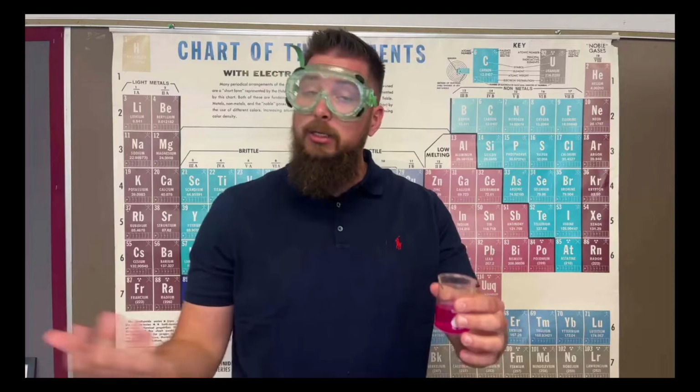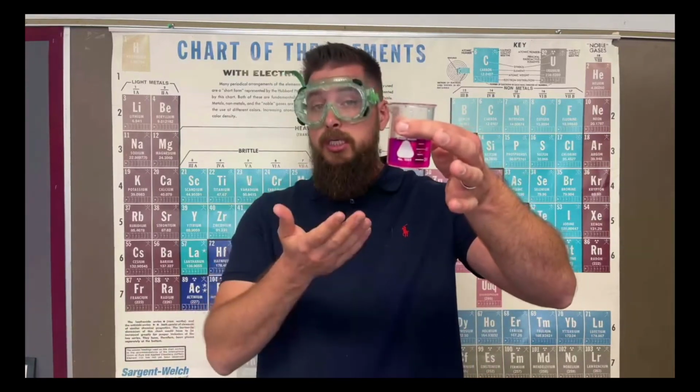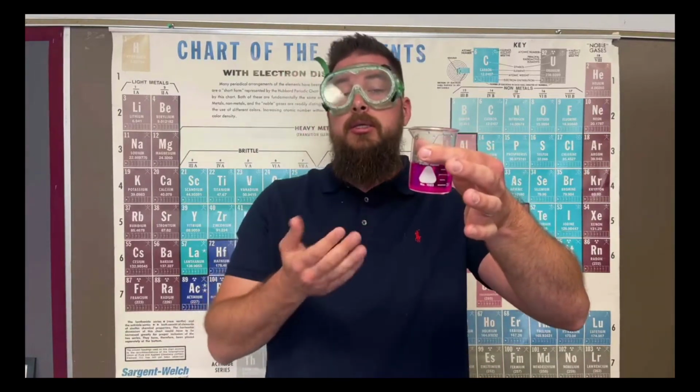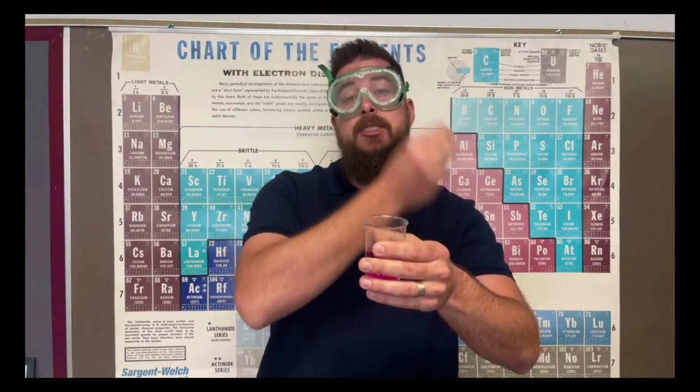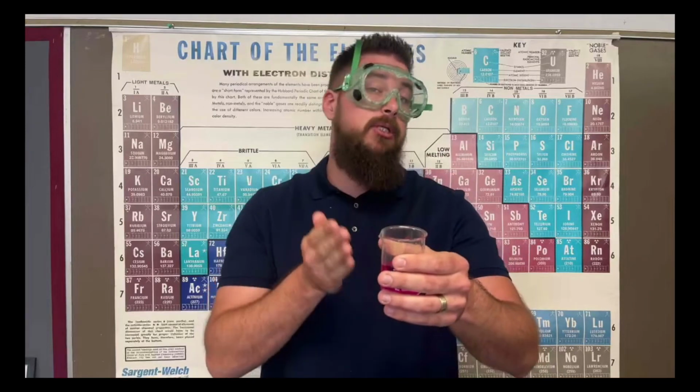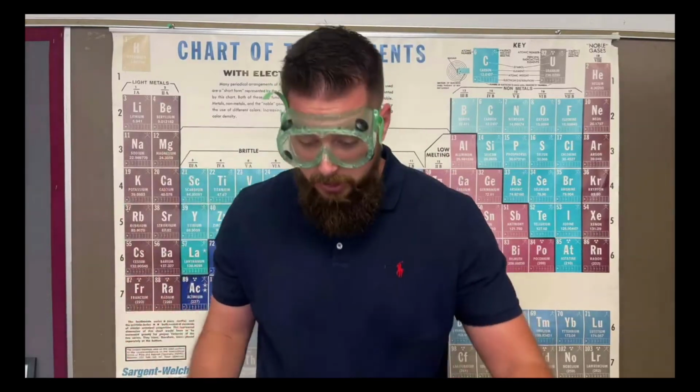And so notice how it's now pink and it's staying pink, meaning that the solution is now basic. Before it was clear, meaning that there was still some acid in there, but now we've reached the point at which it's pink and it's staying pink, which means that it's basic.